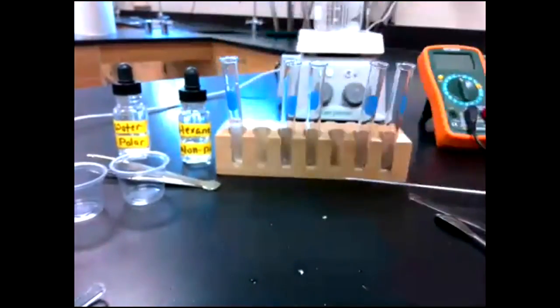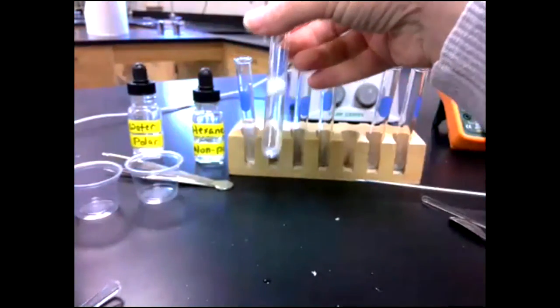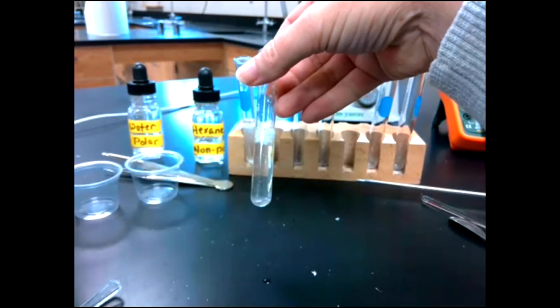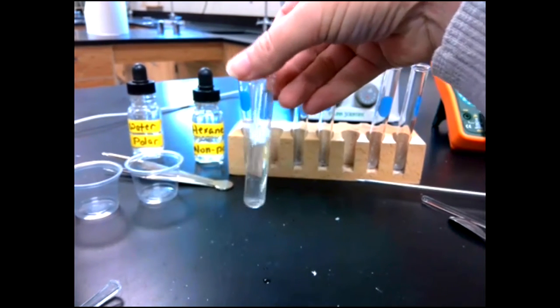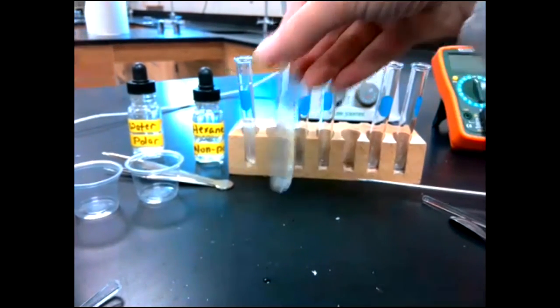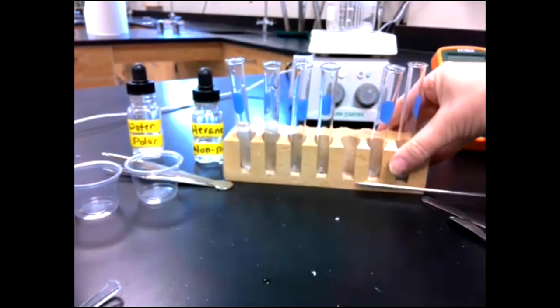And again, I'll shake it. It does not dissolve. I'm not going to hold you in suspense. I could shake it all day and it would never dissolve. So it's going to just sit there, and we're going to come back and look at these later.